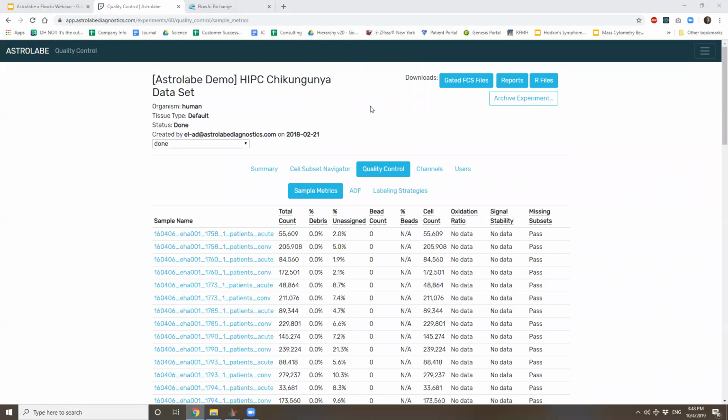So John, are you back by any chance, or are we still out? I'm back. Okay, great. So one more question I have here is, can you please elaborate on FlowJo visualizations other than biaxial plots?